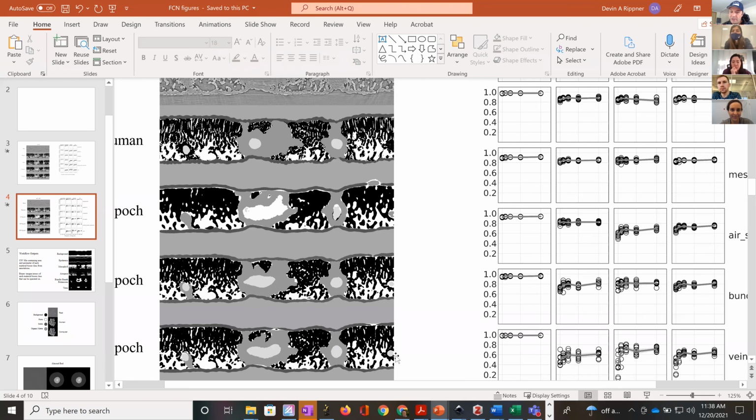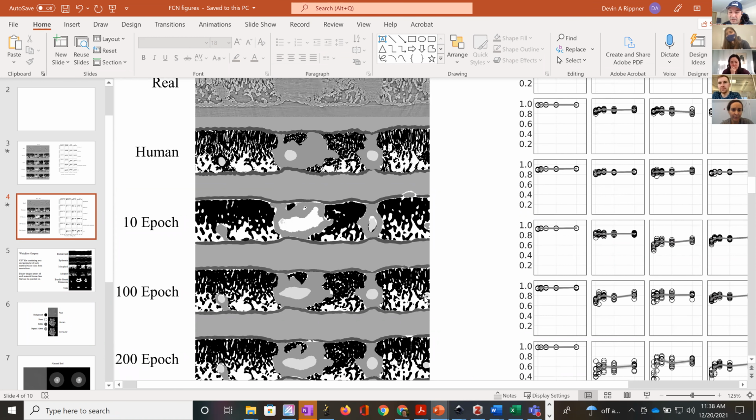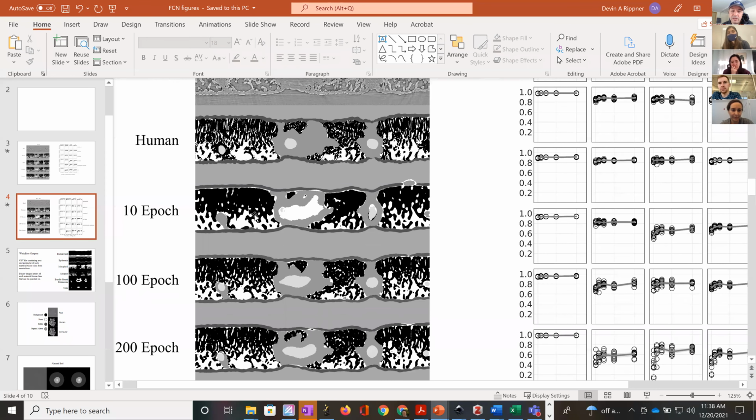The computer can only do as well as it's trained. So if this was marked as a vein, it might be good for the model, but you can see that at some point the computer does a very good job of finding things that even the humans are missing, and quite quickly. And you can adapt this code to any leaf, to stems, xylem.